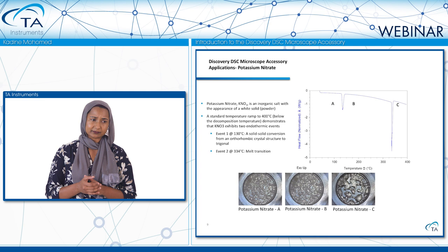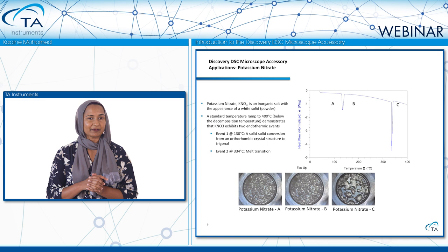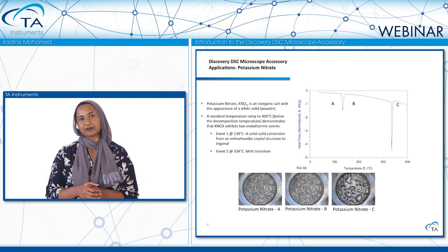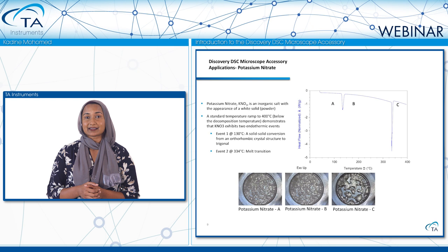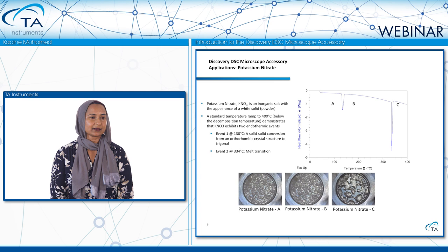That's where coupling the microscope camera comes in handy. Viewing still images at temperatures in regions A, B, and C, we find that going from A to B there are no visual changes in the sample. However, going from B to C, the sample has clearly melted. At 130 degrees, there is a solid-solid conversion from the orthorhombic crystal structure to a trigonal crystal structure, and the second event — the melt transition occurring at 330 degrees — is in fact a true melt transition.